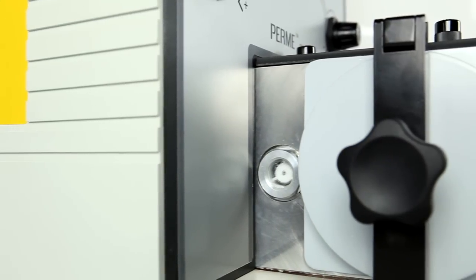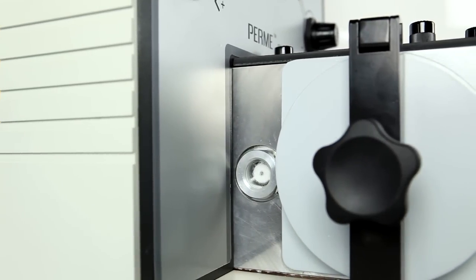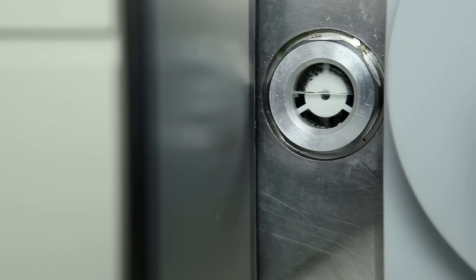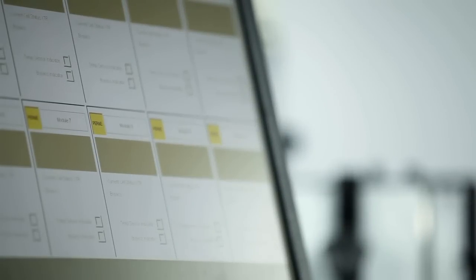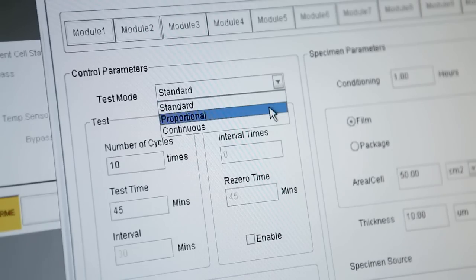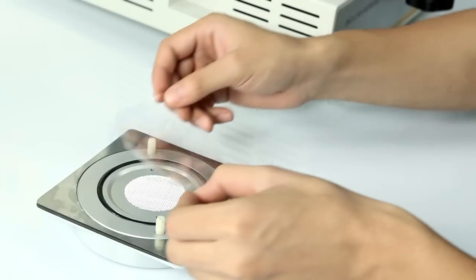OX2230's constant temperature and humidity control function, proportional, continuous and standard testing modes, minimizes errors caused by human factors during the testing process.